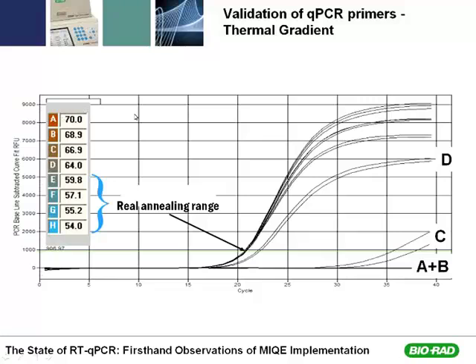And as you can see, you can split each row on a plate by a different temperature, which means on a given plate you could test duplicates of each primer with your samples across six different primer pairs. There are 12 columns in a plate, so in duplicate you could test 6 primer pairs at 8 different temperatures with a given sample.